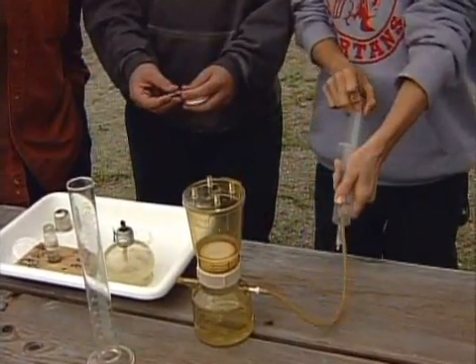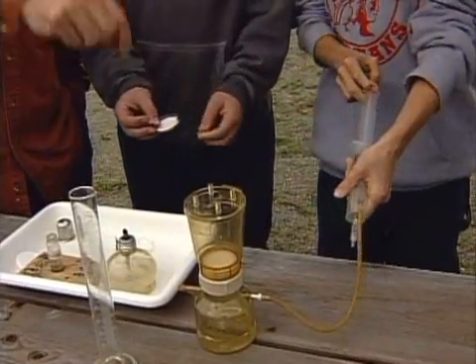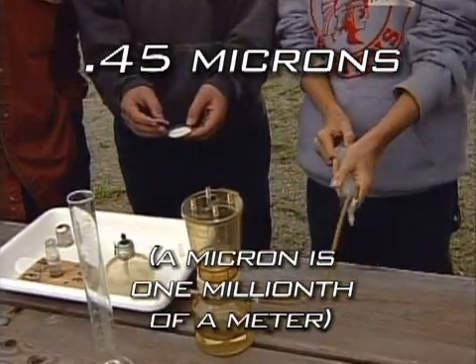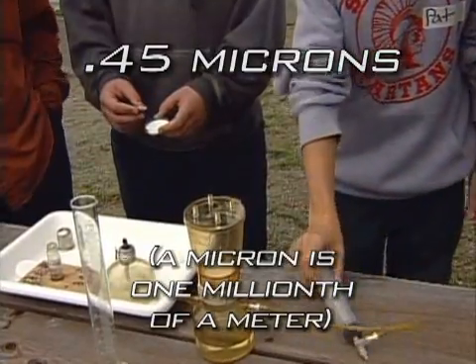And that has small holes in it, so it's designed to trap exactly the same size as these bacteria. So we've got a special paper here, and it's 0.45 microns wide. That's like a fishing net that's 0.45 microns wide, very small. Very small. So you're filtering the water.